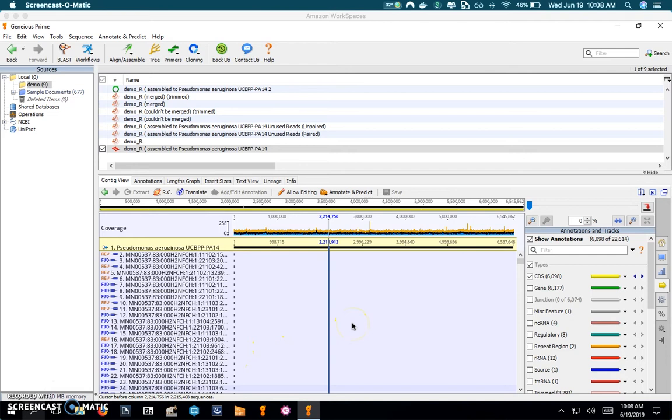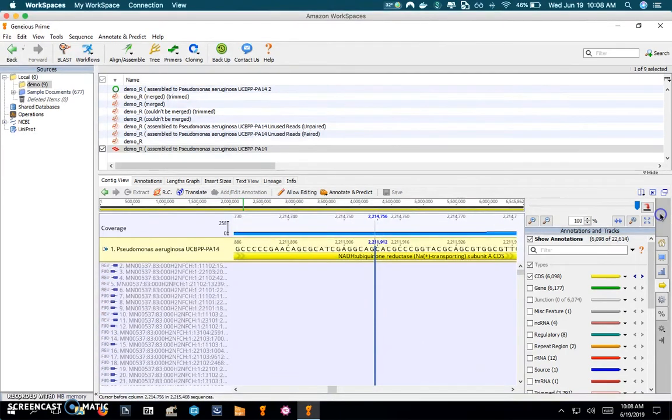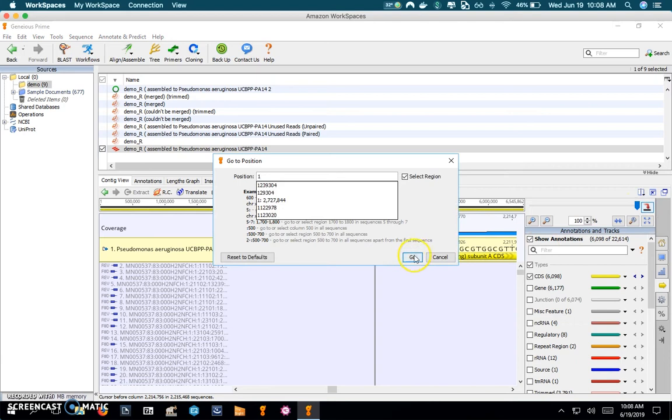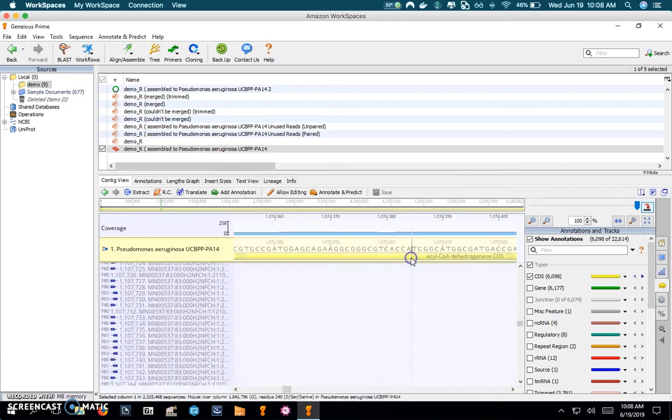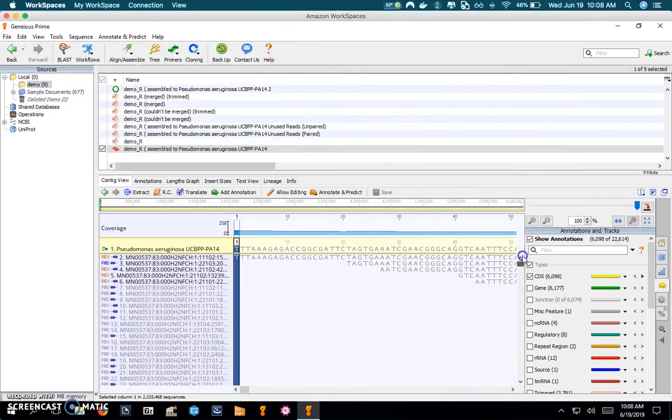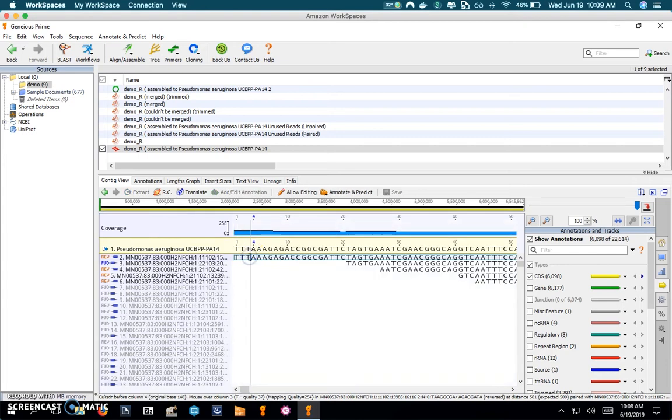So we can do this, zoom in and then go to the first position, first locus, and go all the way to the top here. And what you'll see is a set of reads. So this is the actual first read in the sequence.